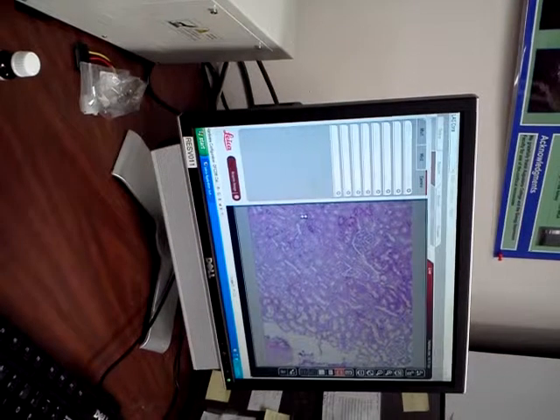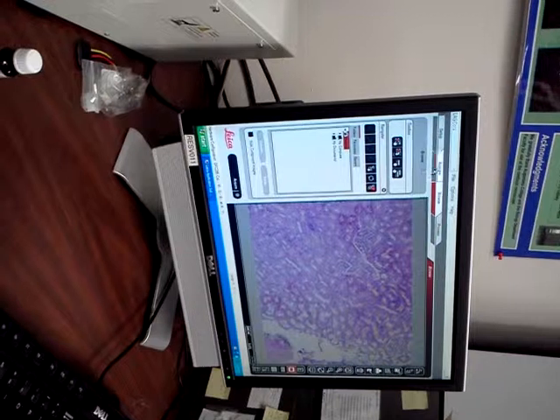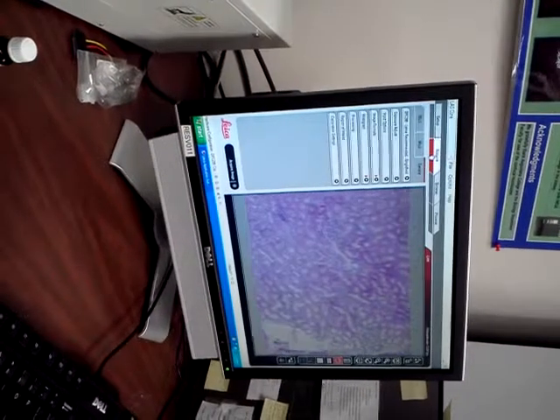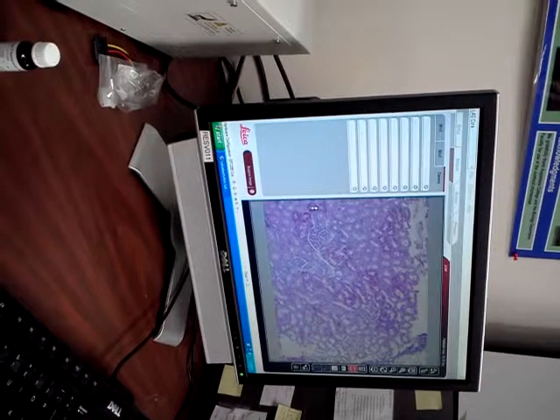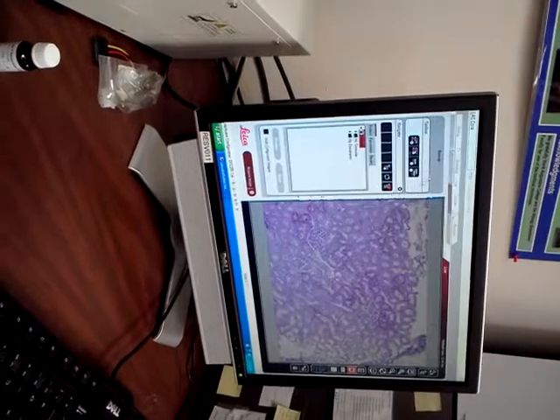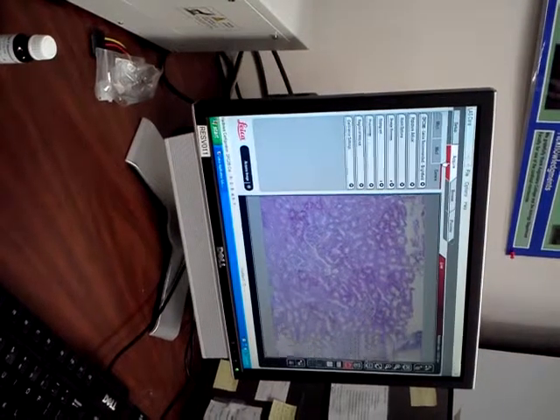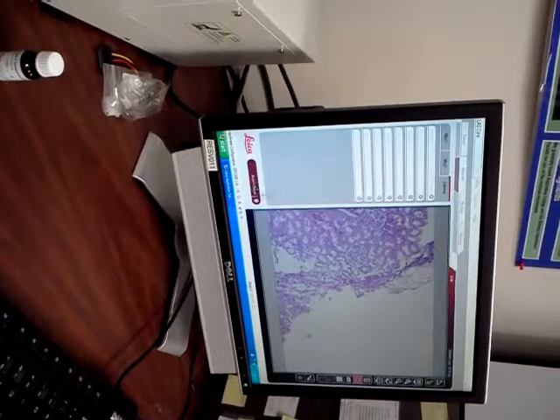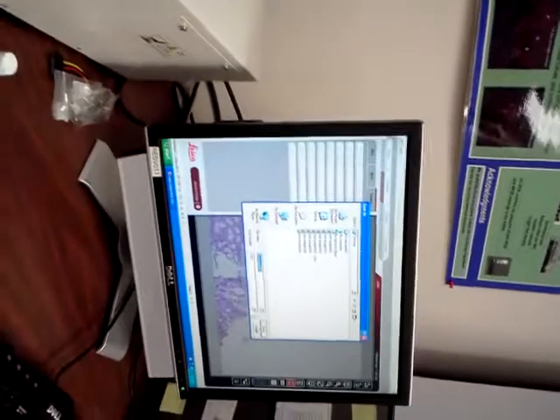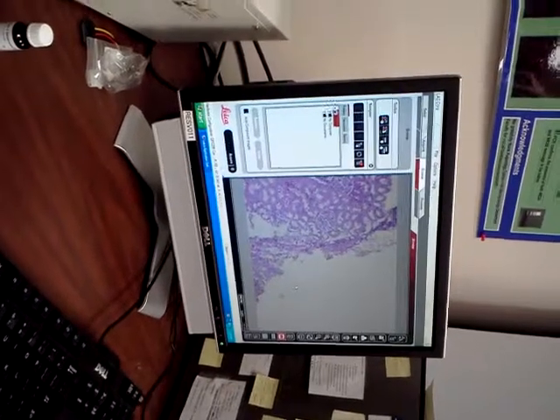It doesn't give you a little grid or anything to show where you've been. Nope. And it is sample dependent. Sometimes it looks good, sometimes it does not look fantastic. So we'll try this out. I went in a kind of square shape. I'll go to process.